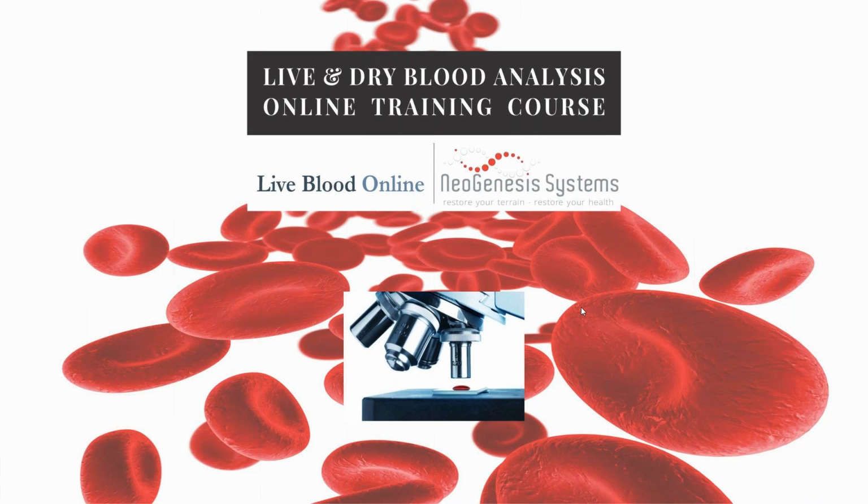So we provide the microscopes. We have them manufactured according to our own specifications by a company in Japan, and we provide them to our students for their practices.